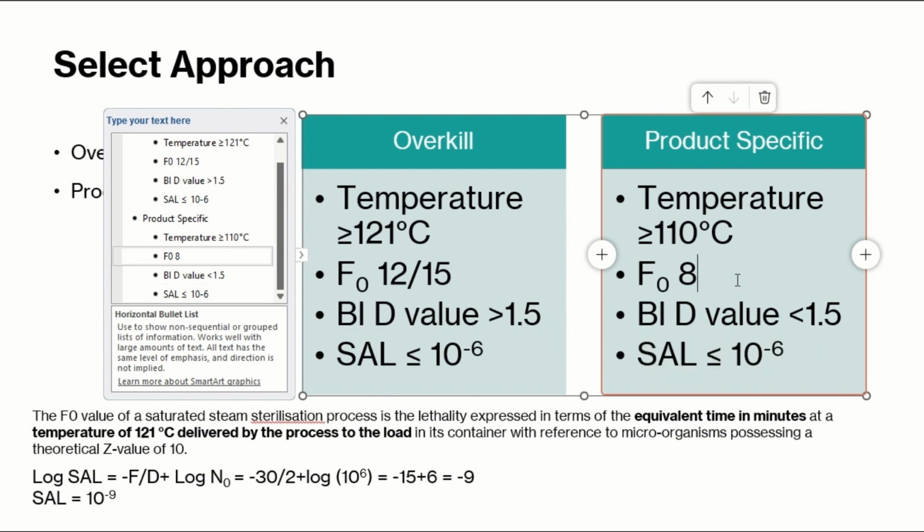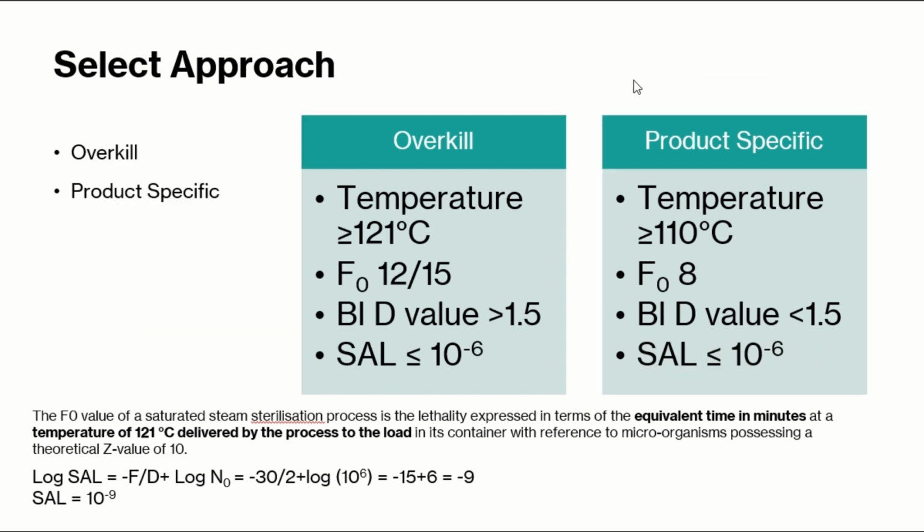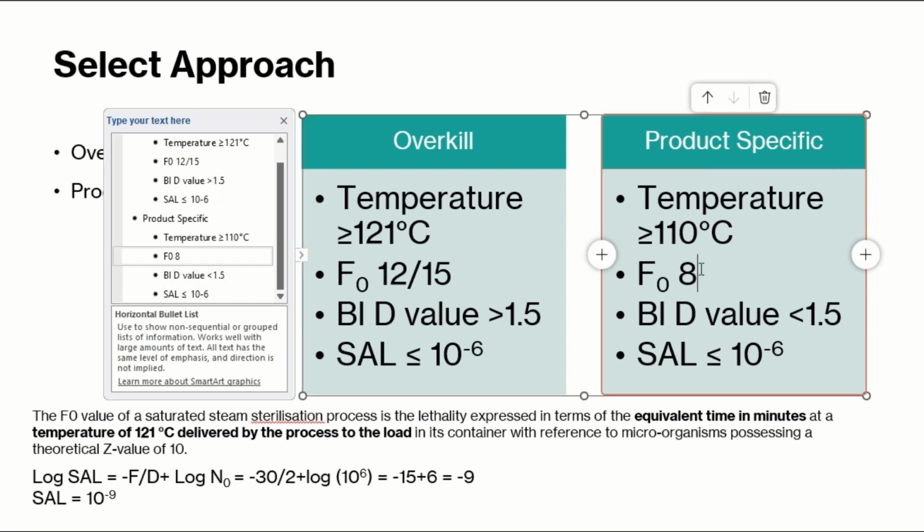As it is 6 log reductions, you could prove that your F0 of 6.1 could be fine for your product as well. So there is no such requirement for the US, but keep in mind, if again your product is global, just make sure you have an F0 of 8 at least at the end of your cycles, which is really important.